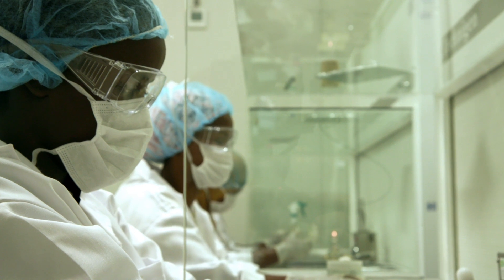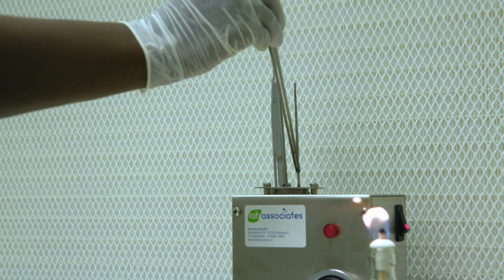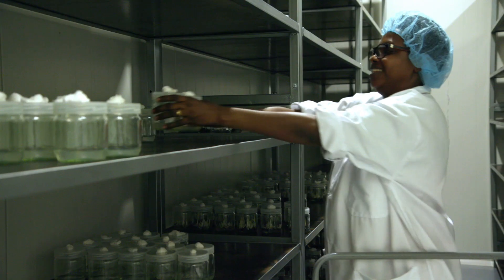Every four weeks the plant tissue is subdivided in a laminar flow cabinet. The utensils are sterilized between each cut to prevent any contamination. The plant tissue is then transferred to growth chambers.